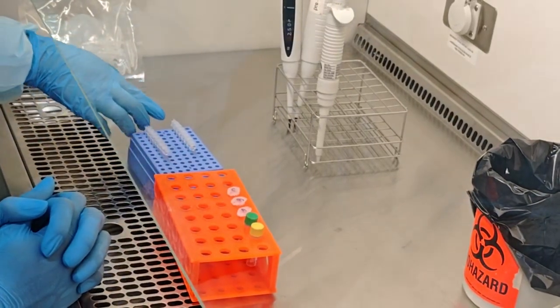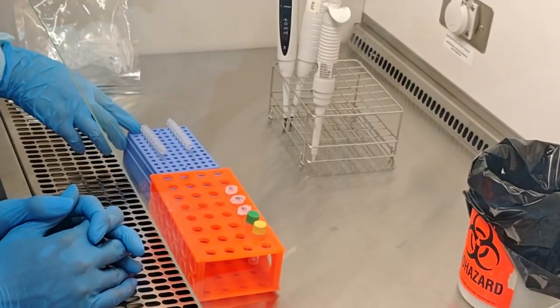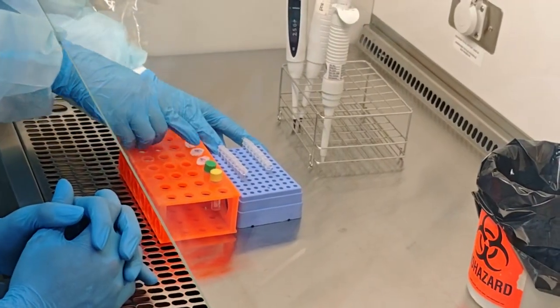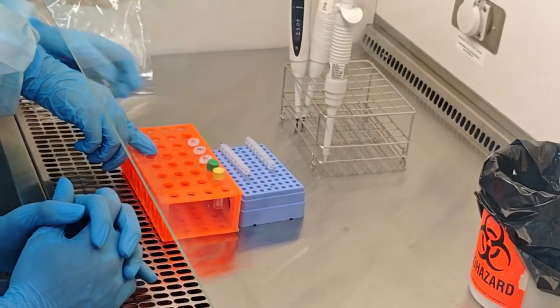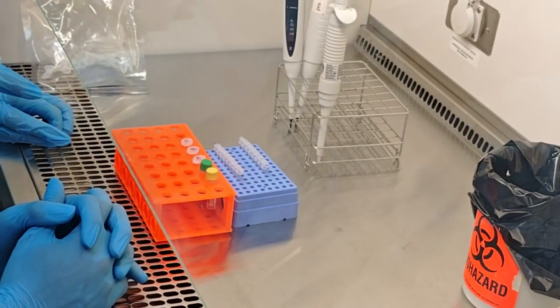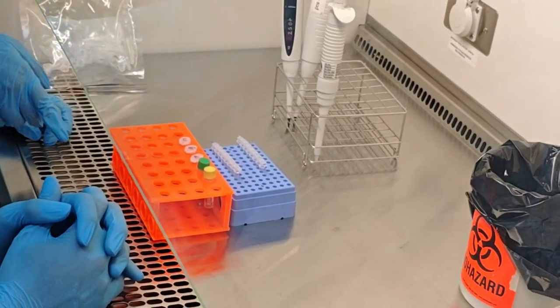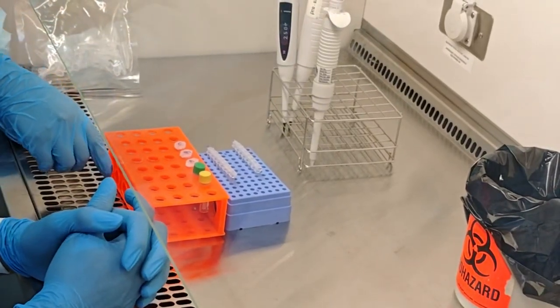And here I have signed for H and you sign S here and here. We can let this be the first sample according to this. This is for this and this is for this. The order you need to remember. Because if you don't remember the order, this experiment fails, because you cannot figure out which one represents which one. That is to match each other. The order is very important here.